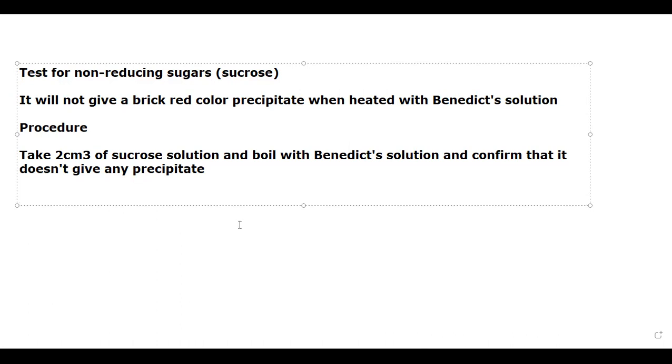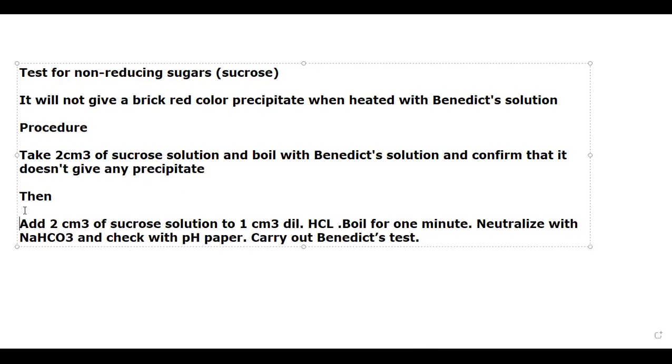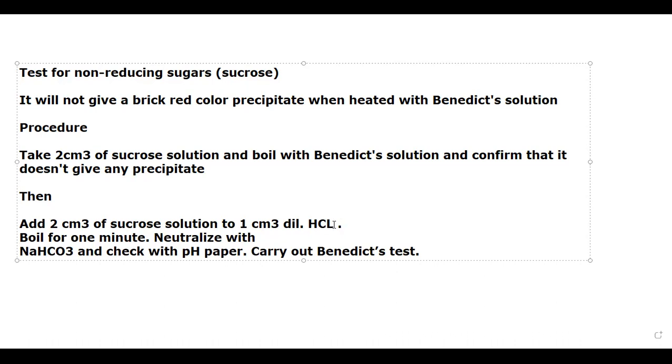Thereafter, you need to do this. What do you have to do? Add 2 cubic centimeter of sucrose solution to 1 cubic centimeter of dilute hydrochloric acid.